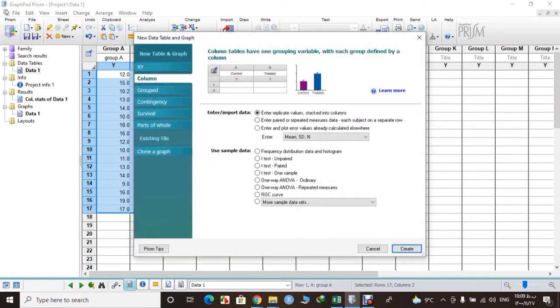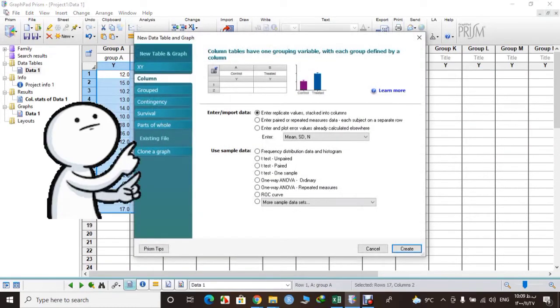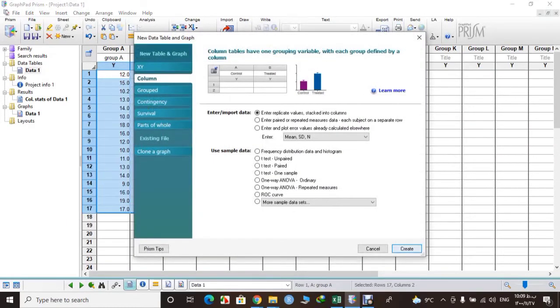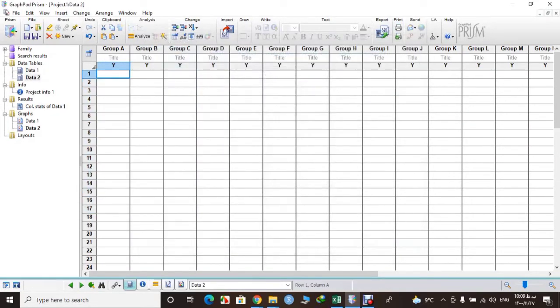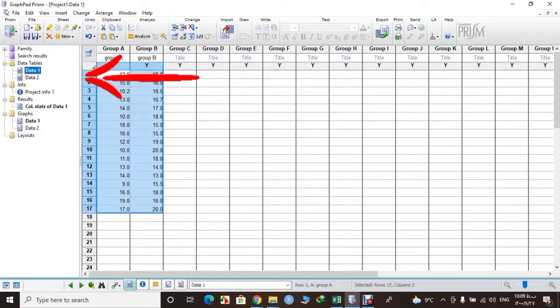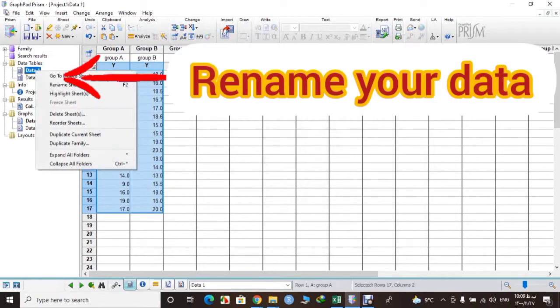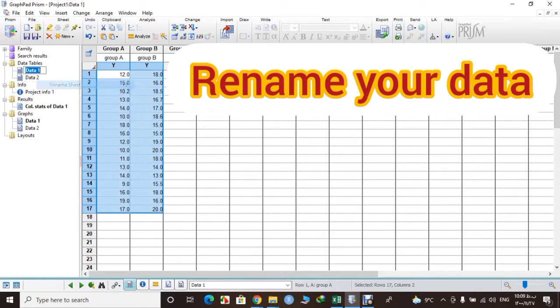We want to do one-way ANOVA so we will select Column and then Create. And you can rename your first data so you will not confuse between them.